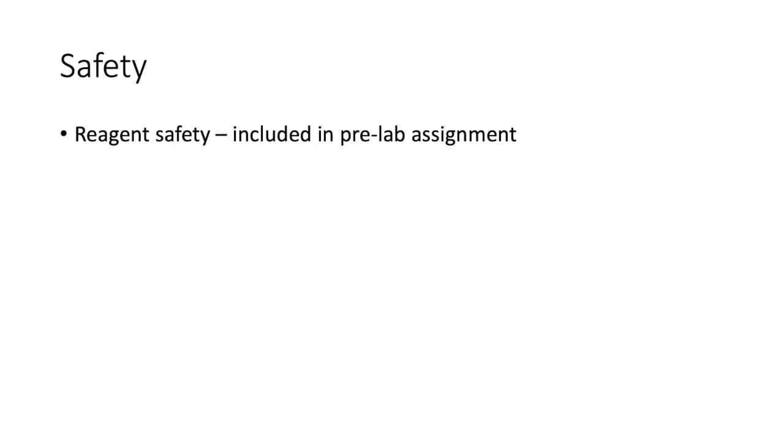While these reagents are relatively safe to work with, we still need you to look up the safety information for several of them. Please make sure to look up safety datasheets of the appropriate concentrations.